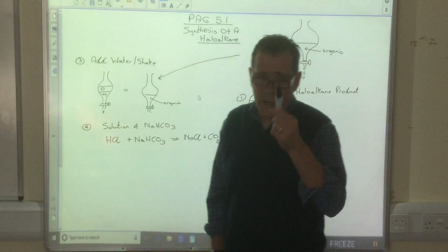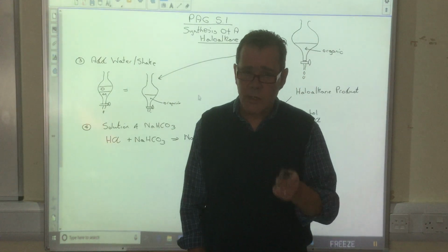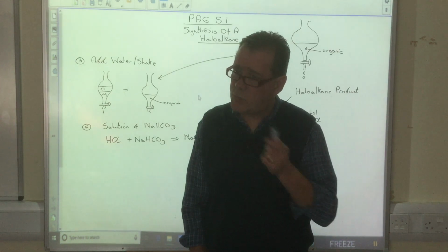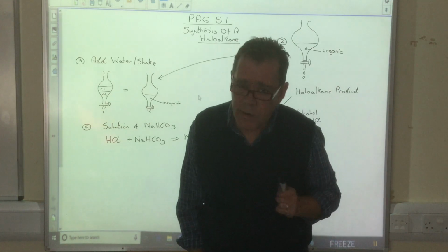So in summary, it separates any aqueous components from any organic components, any aqueous reactants, in this case, from organic products, the haloalkane.